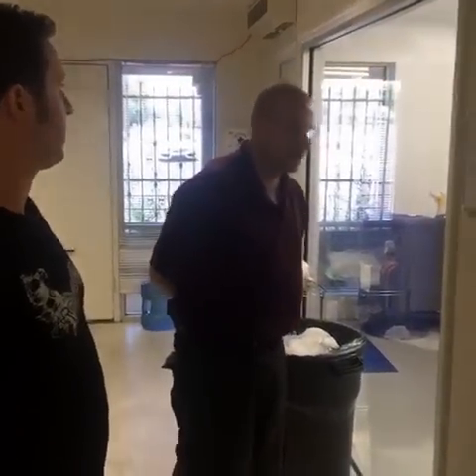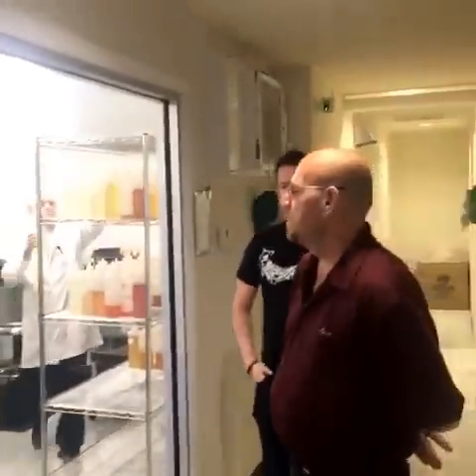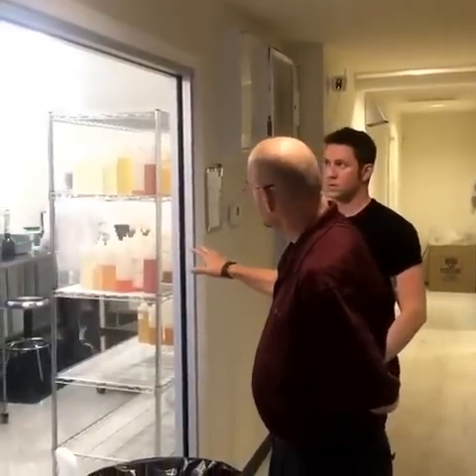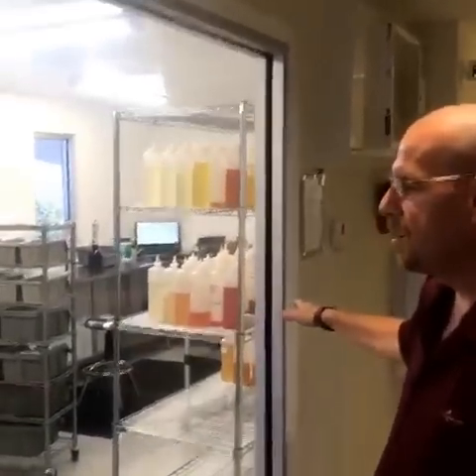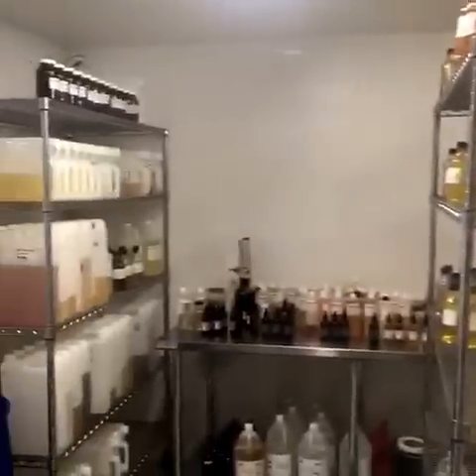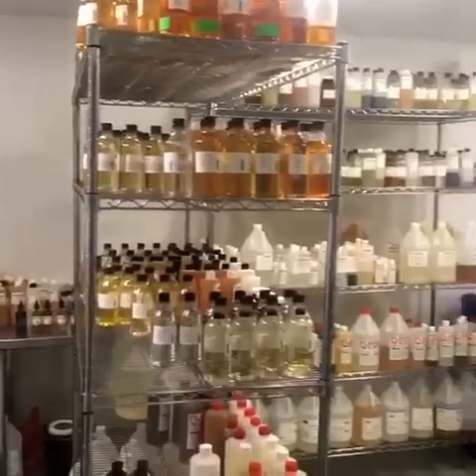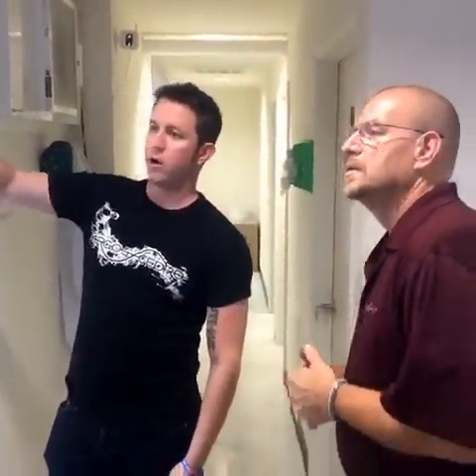Every day the floor is swept and mopped with an alcohol solution that is usable in a clean room environment. And then once a week, all of the work surfaces, all of the carts, and all of the other surfaces are wiped down. Walls, ceiling as well. The interior of the lab is coated with an antibacterial paint that gives us an extra added layer of cleanliness and reduces any biological hazards. And I'll go through, once we go in, I'll kind of explain.